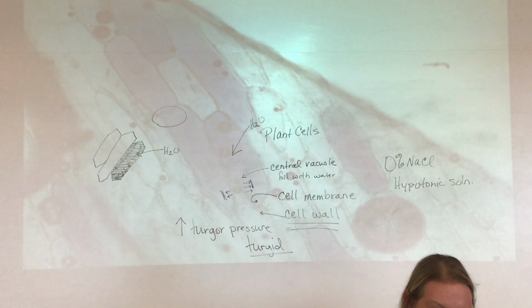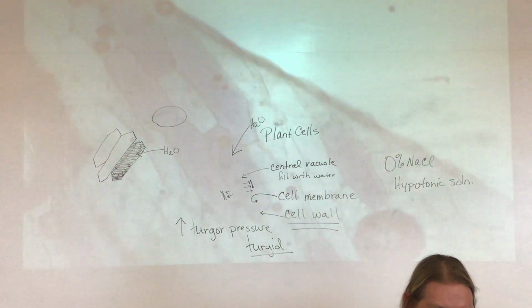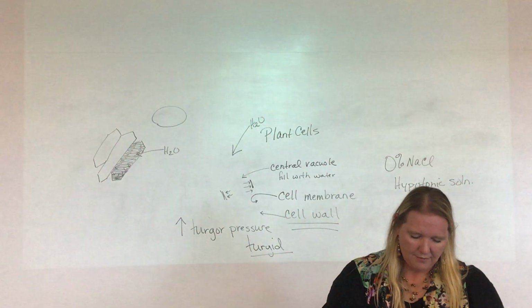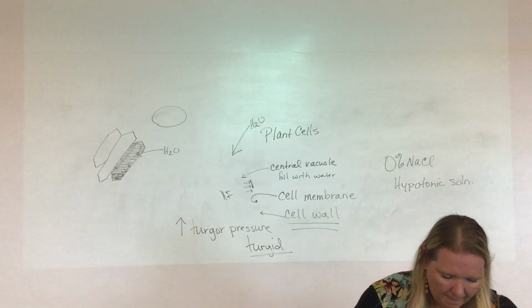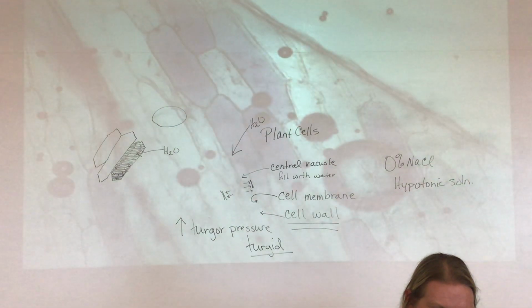So this may take just a few minutes, but what I'm going to do is talk about, there's some air bubbles, those big circles are air bubbles, because the sample is not completely flat. That onion will roll up a little bit. Just moved it to another spot.